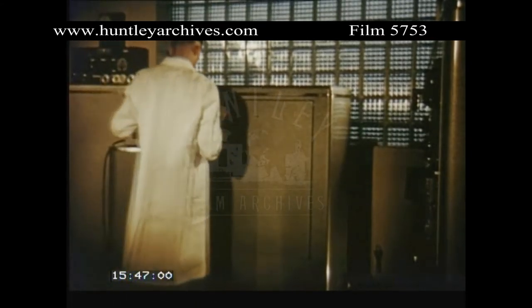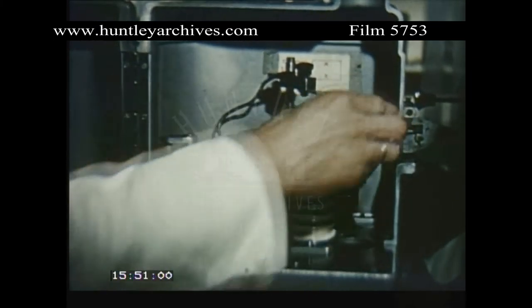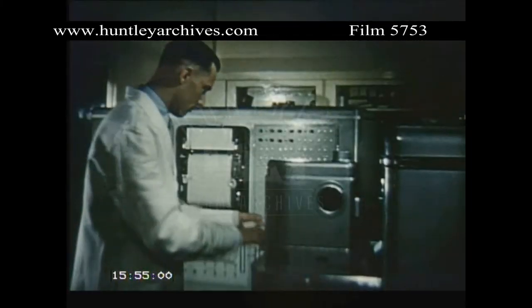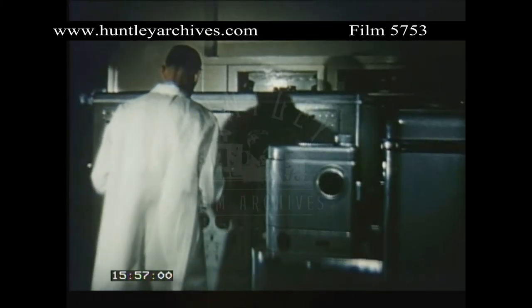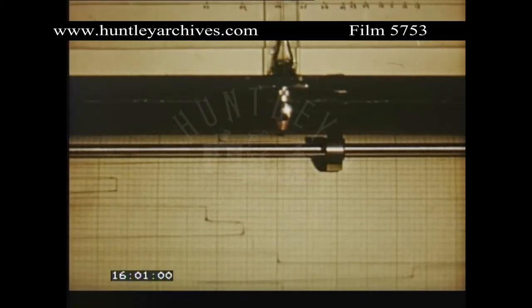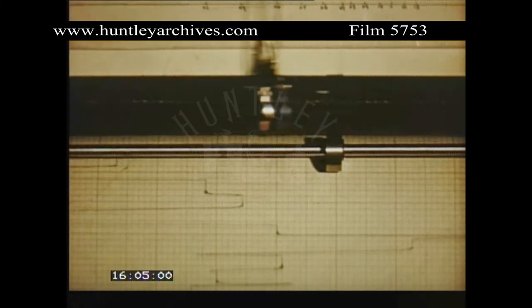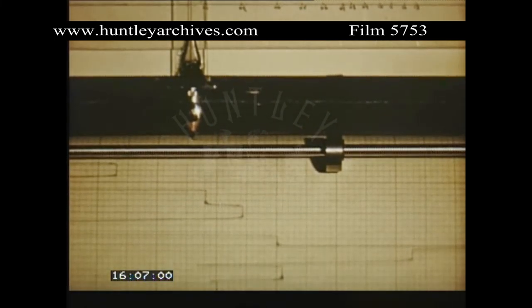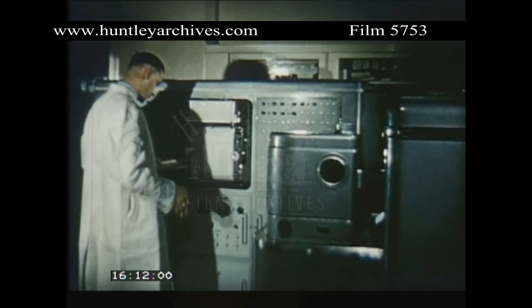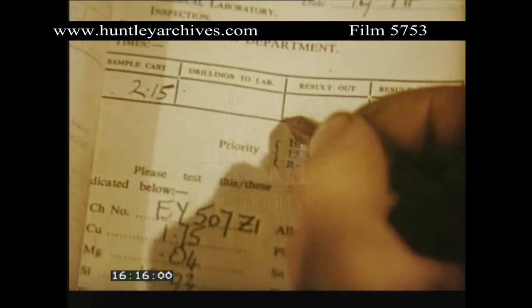When the sample has been trimmed and machined, it is sparked for a fixed period, during which each photocell measures the brightness of its spectrum line. The information is fed to the recording console, which measures and records the quantity of each element in turn. The analysis, which would have taken at least two or three hours by ordinary chemical methods, is complete in five minutes.